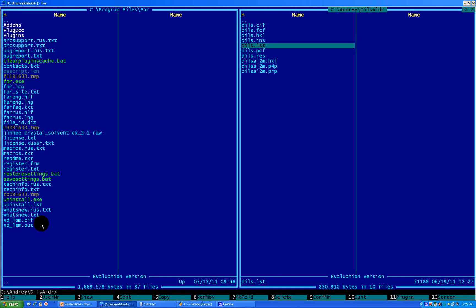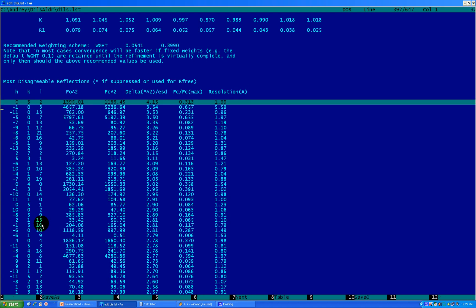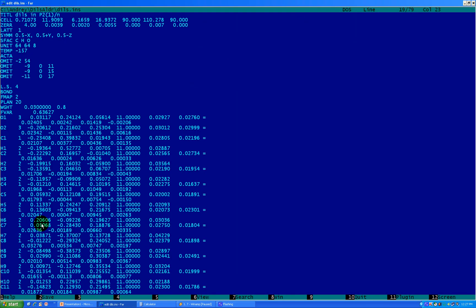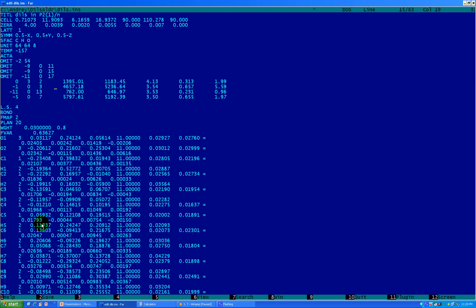Let's check the LST file for bad reflections. You can clearly see we still have this one bad reflection. In fact, I can even delete it. Why not delete several more bad reflections? It's supposed to help us. So, again, Ctrl-C, Escape, go to your INS file. You see the free line below the OMIT. Ctrl-V, paste it. Go to the selected area with the cursor. Press Alt-Arrow down, deselect it.